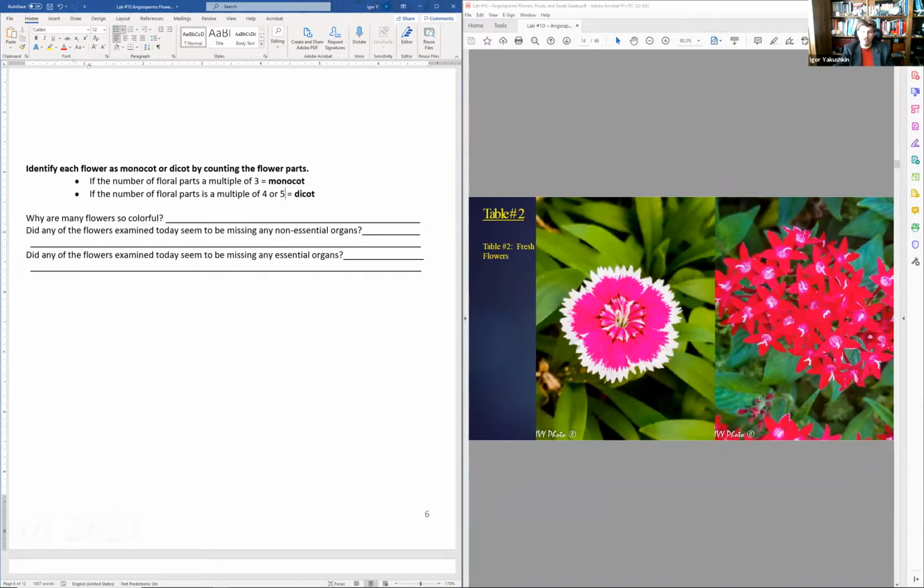I'm like, okay, well, let's take a look at another flower and also look at the venation. Here you have a pinnate venation, so non-parallel, most likely a dicot. And now let's take a look at another flower. And we looked at another flower and it had 5 petals. He's like, what about this one? I'm like, well, that's a mutant. It had 7 petals. Sometimes that happens. So careful with that, all right? So those ones, you're looking at the dicot.